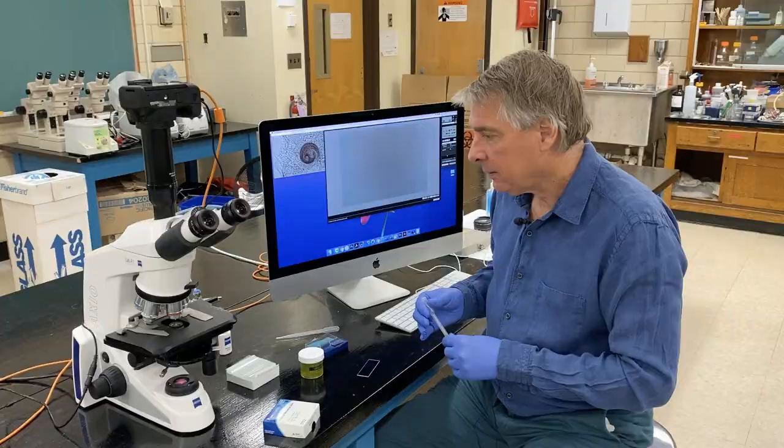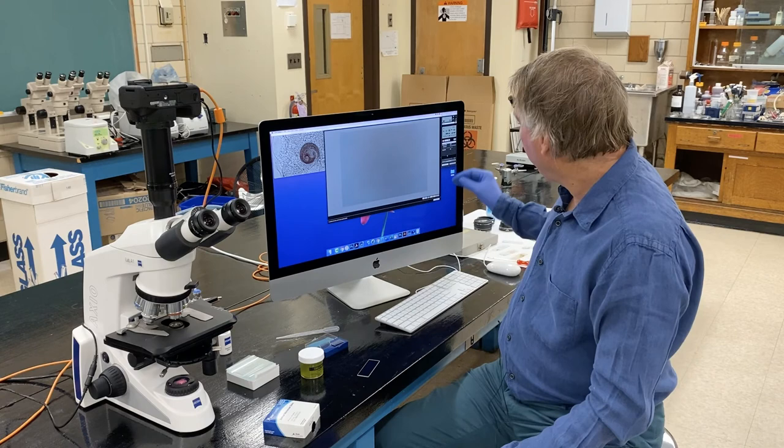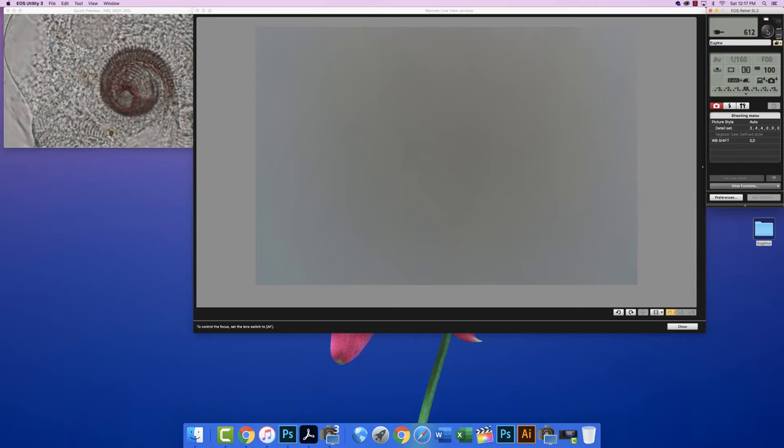Okay, so that was Stentor. I took that slide off of the microscope. I reset the microscope objective to 5x. I brought the power to the light source down so that my shutter speed would be, I wanted it to be 1/25 of a second, so let me bring it down to 1/25. I'll recheck my white balance.